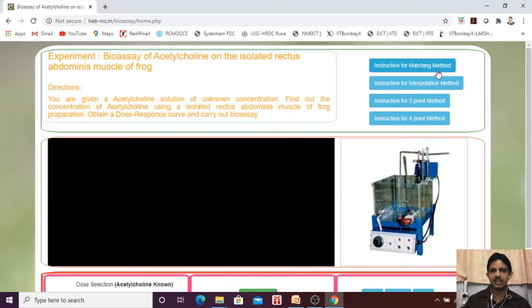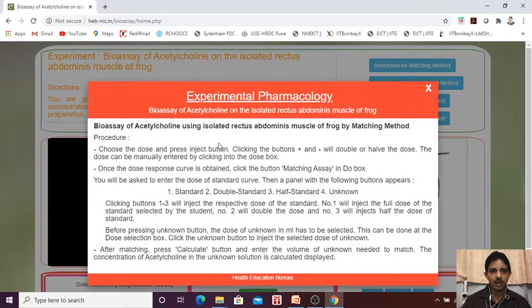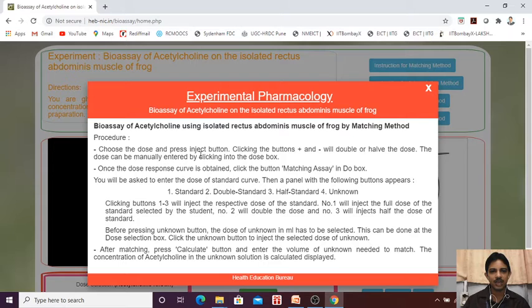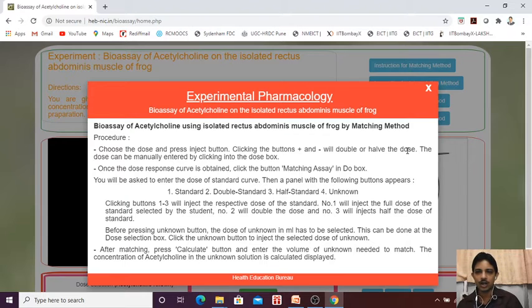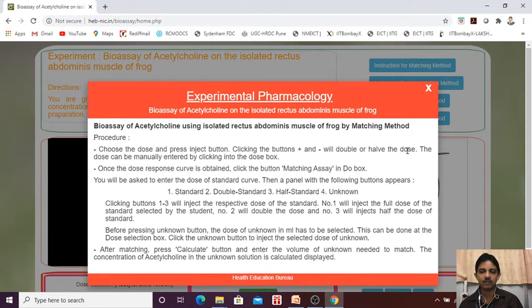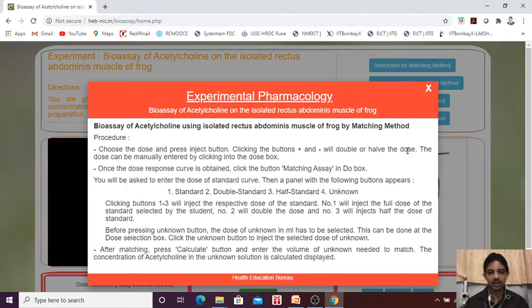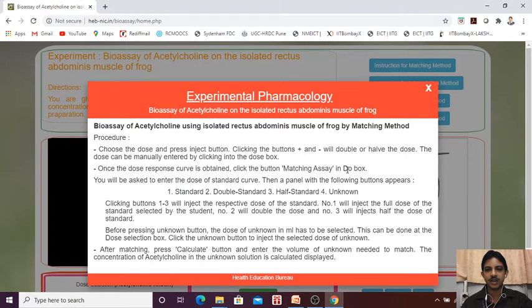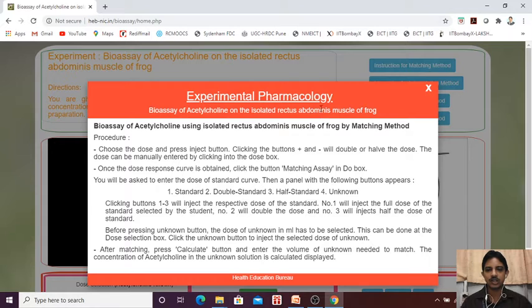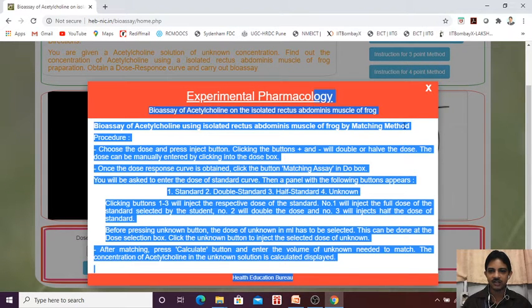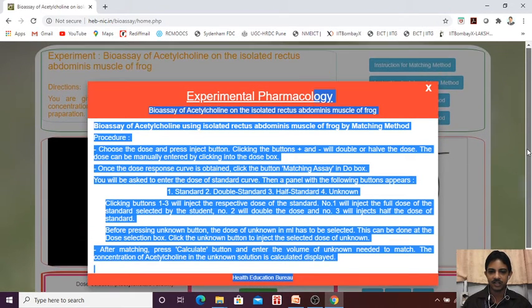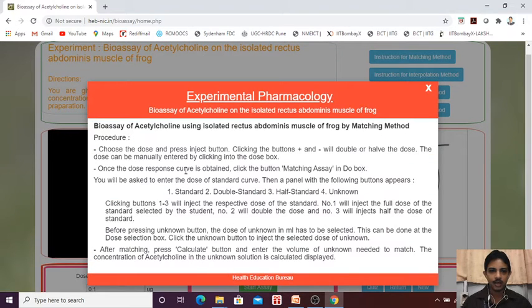We will see the instruction procedure. Choose the dose and press the inject button by clicking plus and minus, or double will double or half of the doses. Like that, what we are going to do, we are going to first find the CRC or the DRC of acetylcholine. Once dose response curve is obtained, click under the matching bioassay in assay box. Here actually it is written as start assay.